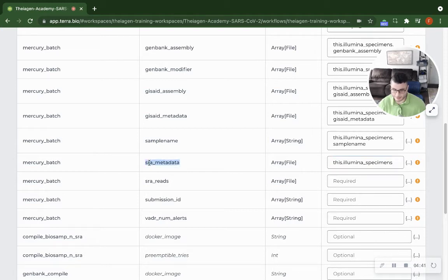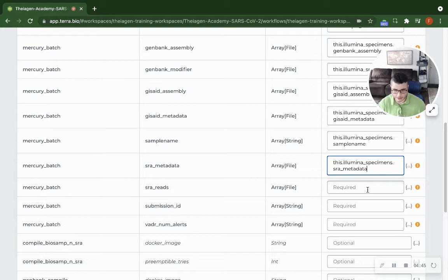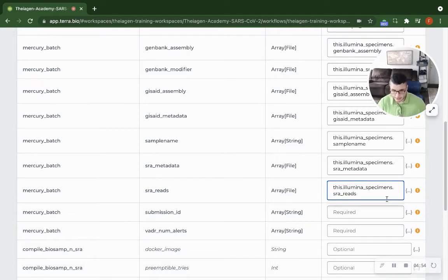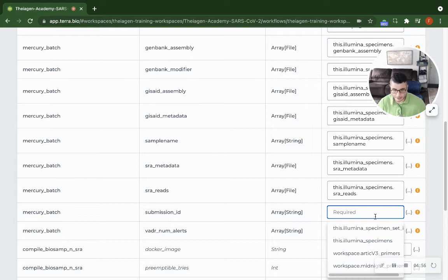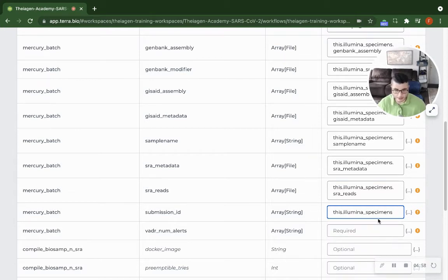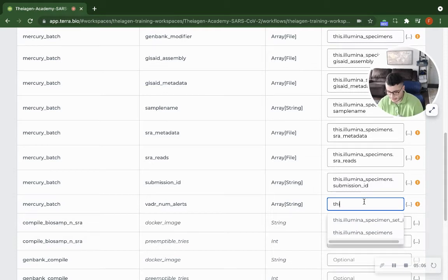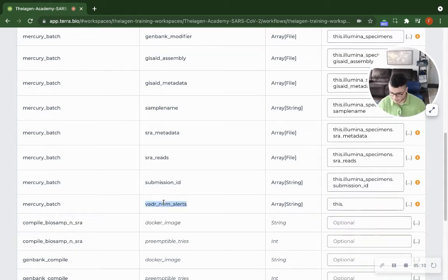So rather than having to download all of the data to a local machine and then re-upload all of that data to NCBI, one can simply move the data from cloud to cloud. So from the Google bucket location that Terra uses to house the data directly into the NCBI database without it ever needing to touch a local machine.